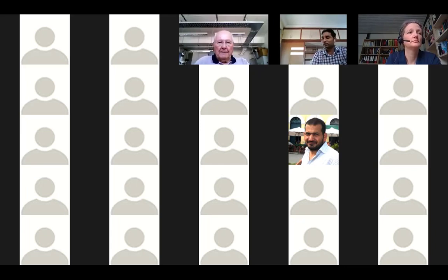Okay, good. I just wanted to ask whether you are getting any aluminum fluorescence from the background, from the chamber. But you say nothing. That is good. But when you use synchrotron? No, not synchrotron. I am just asking, is there any background fluorescence of aluminum? No, it was not coming. We have checked that the background from aluminum is not coming at all. Okay, fine. That is what my worry was. That is my question. It is very good.